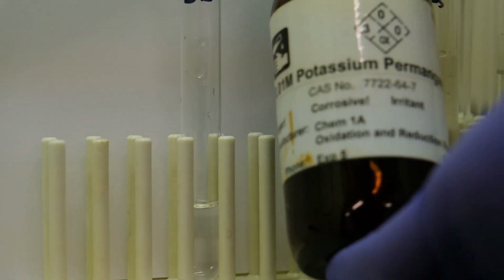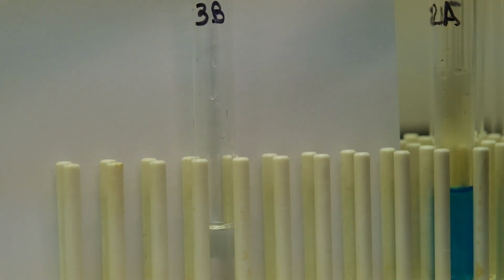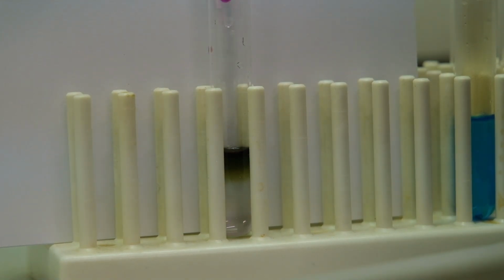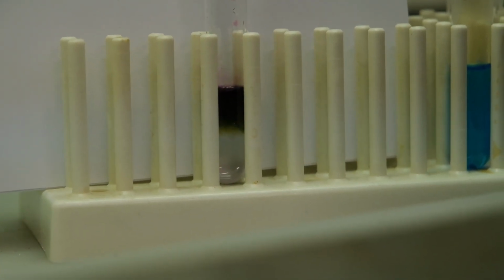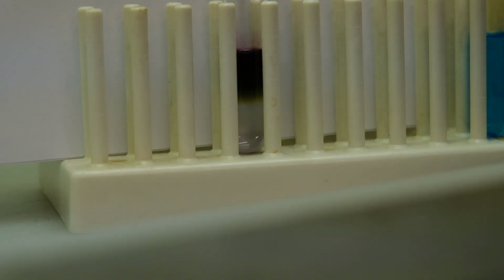Now we're going to add 10 drops of the 0.01 molar potassium permanganate. Now record any observations you see.